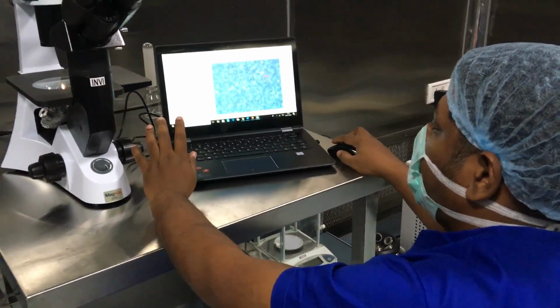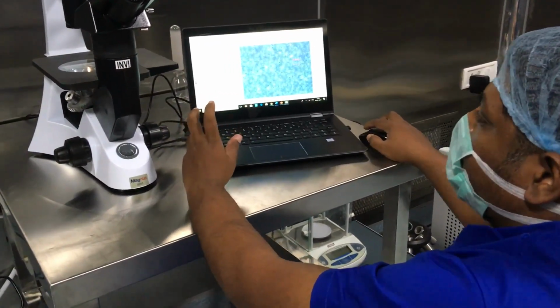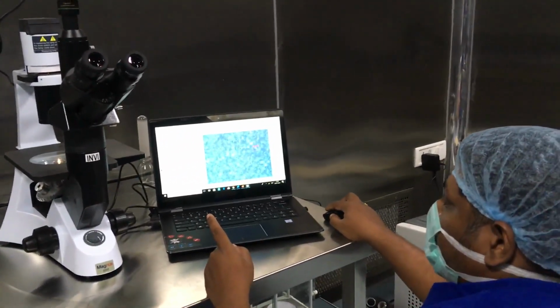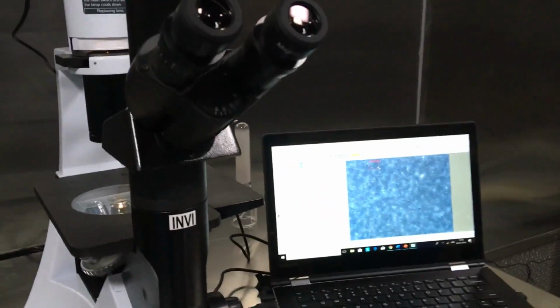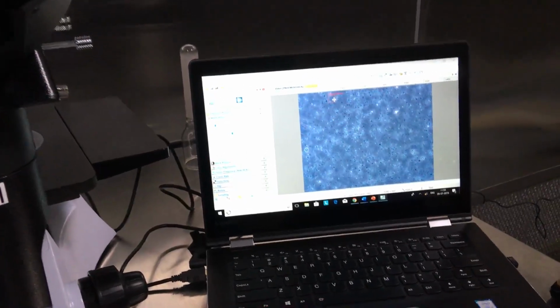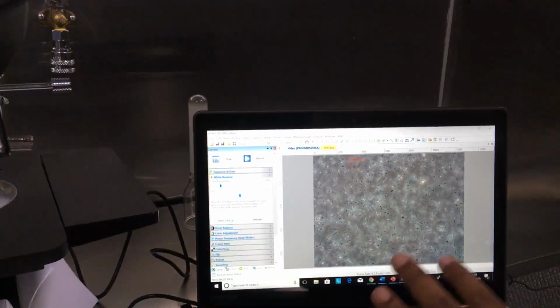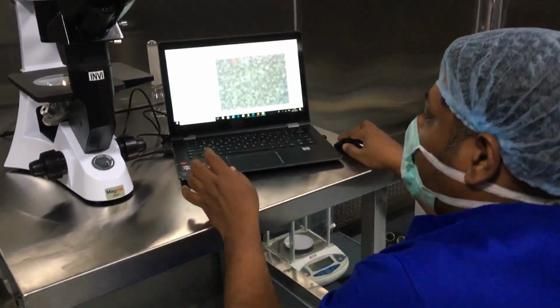And for white balance, sometimes the camera may detect some bluish, reddish, different colors. So by then you just select collapse white balance, and you can see this one, and place the small square at some white area and just select white balance. So accordingly your sample will be changed. And again, once it is done, then collapse again.